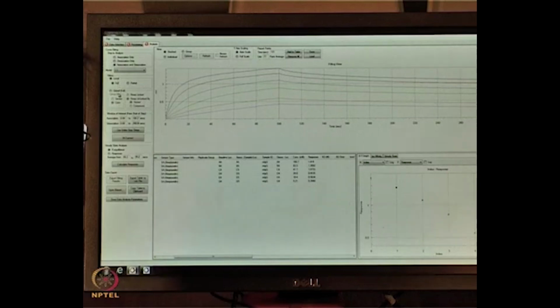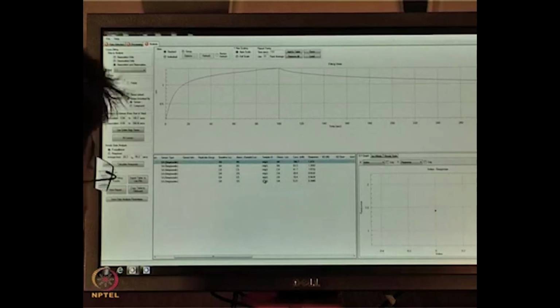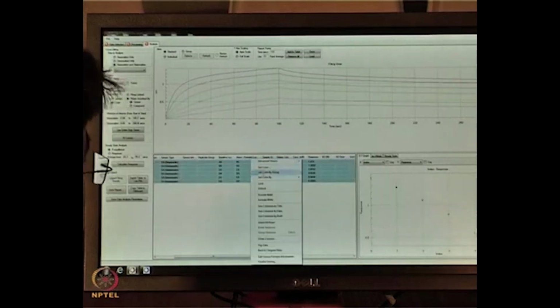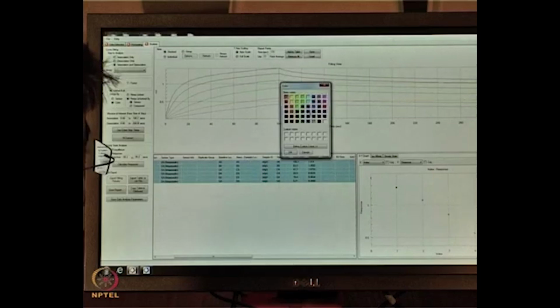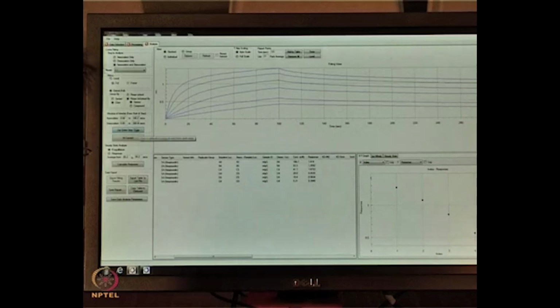Most of the time, when you are performing interaction studies, we always go with a global fitting. So now I have to choose a global fitting, with respect to color and Rmax unlinked by sensor. To perform a global fitting, we have to select all the samples and change to one color. So I will change to a blue color. Now you can see this is a 1:1 binding model. I have to use the entire step, and I have to fit the curve.